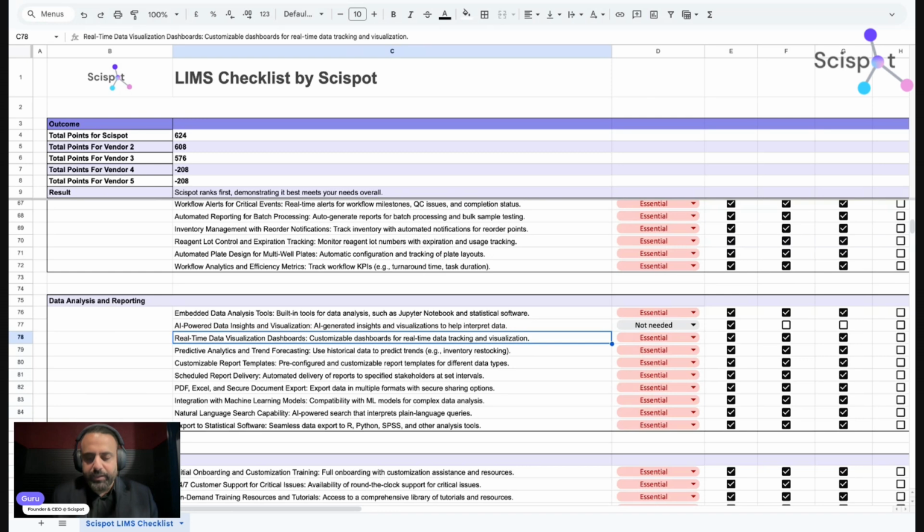I was speaking with someone yesterday. They said they are not going to name the system. They implemented a system because they prepare a recipe and test the material they produce in their lab. Every time they need to add new metadata, they have to contact the vendor, and then they receive a bill from the vendor on a regular basis. So you want to avoid very custom systems, especially if you're a modern lab or a smaller company, SMBs. But if you're a massive company, then maybe there are some advantages to picking a big enterprise vendor.